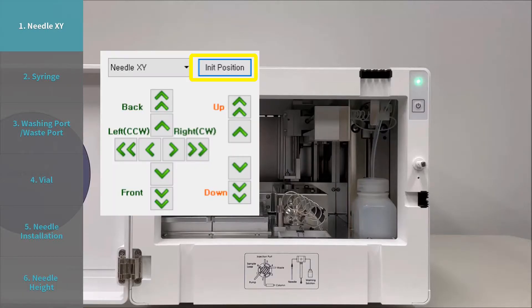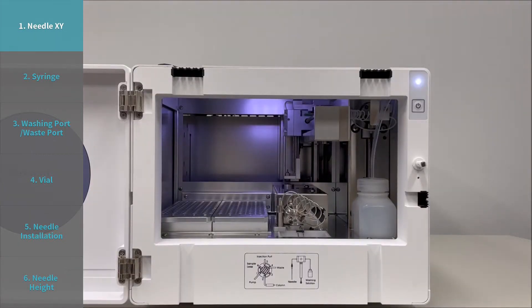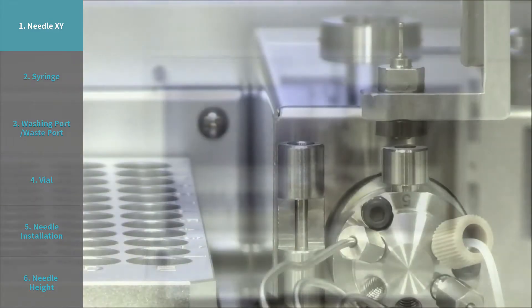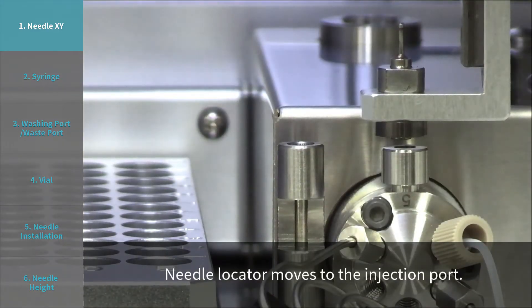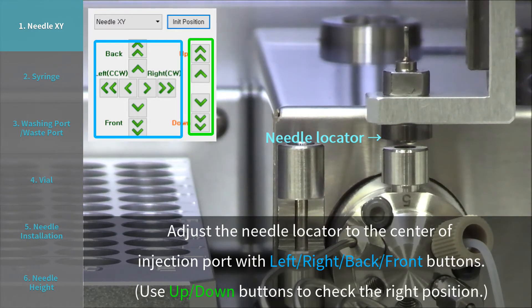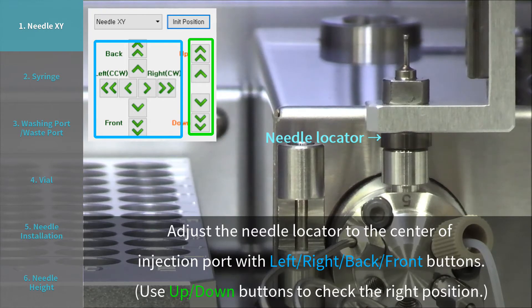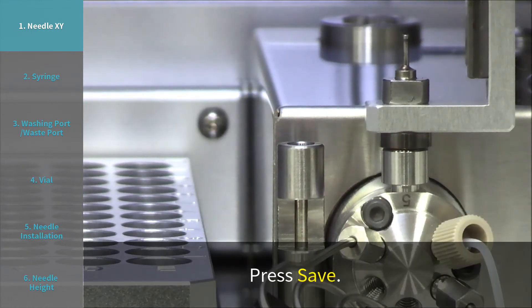Step 1: Needle X Y. Choose Needle X Y and press INIT position. The needle locator moves to the injection port. Adjust the needle locator to the center of the injection port with left, right, back, and front buttons. Use up and down buttons to check the right position. Press save.